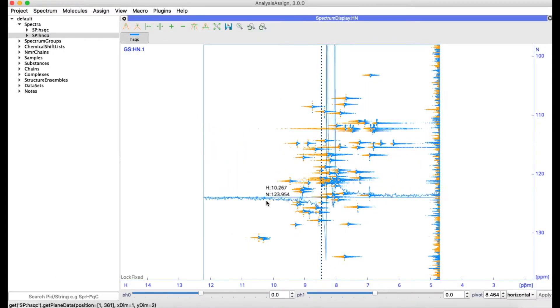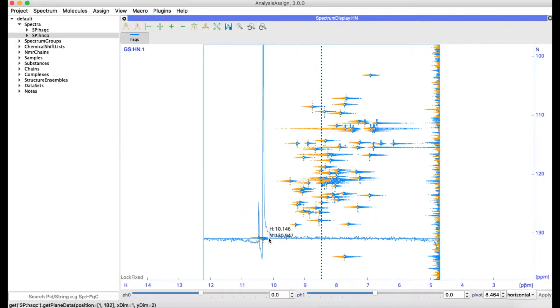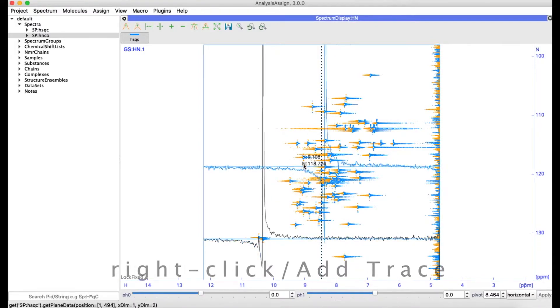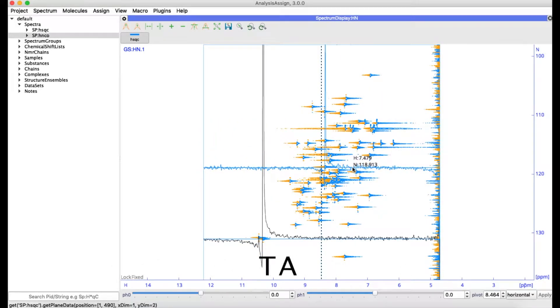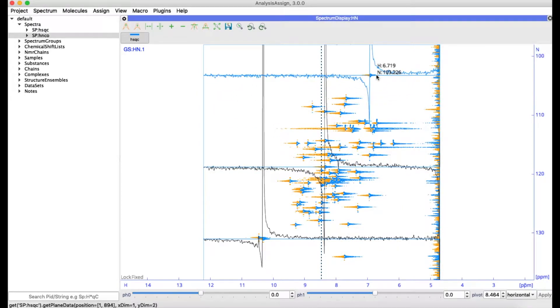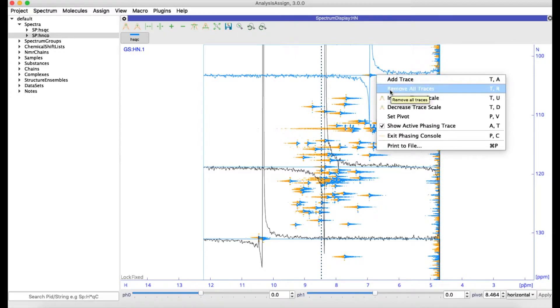You can now select the traces you want to use to do your phasing. You can do this either by using the right-hand mouse menu and selecting Add Trace, or simply by typing TA. To remove all your traces, type TR or do it from the right-hand mouse menu.